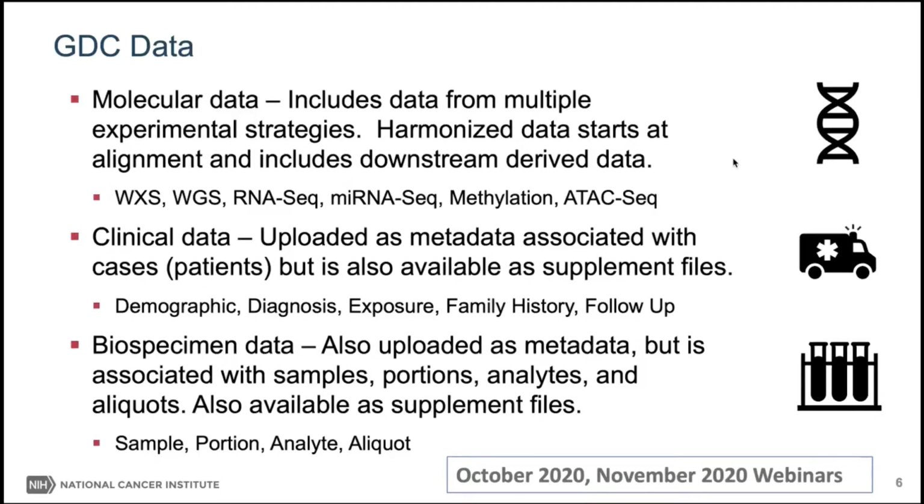At the bottom here, I'm probably not going to mention this every time, but I want to make you aware that in the past we've done many of these monthly webinars, and a lot of the features that I talk about today were talked about a lot more in depth in a past webinar. On the bottom, you'll see some months. These are webinars that went more in depth about each of these features. If you go to the GDC website webinar page, you can scroll down. I believe they are in reverse chronological order, and you can come upon whichever one you need to.